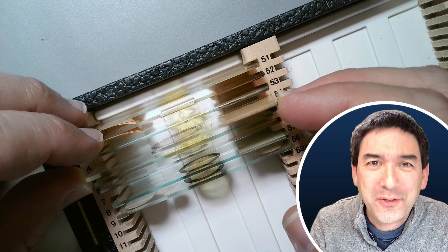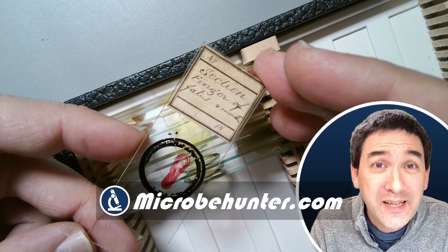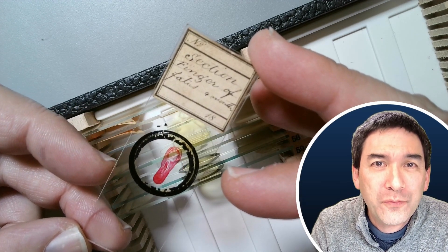Hi, hello and welcome. Microbe Hunter here — look what I got here. I would like to show you this slide. It's a pretty old slide, an antique microscope slide, and it shows the cross section of a four-month-old fetus.